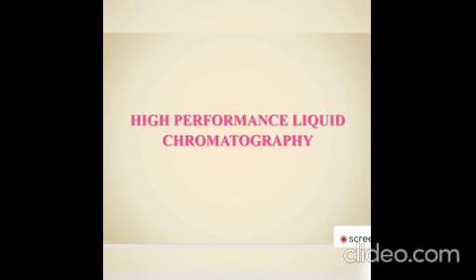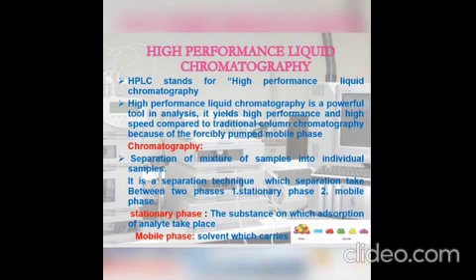Hi all. Today we are going to discuss HPLC. HPLC means high performance liquid chromatography. High performance liquid chromatography is a powerful tool in analysis. First we will discuss chromatography.